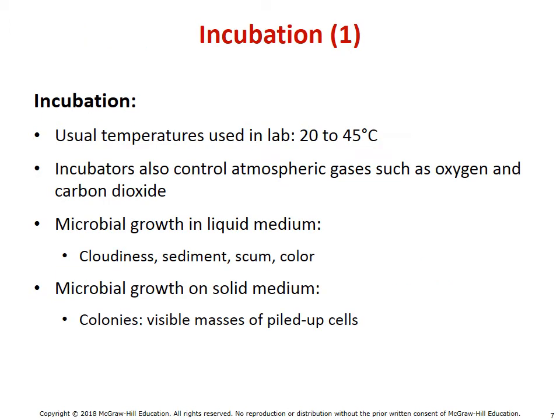The next I that we should talk about is incubation. Incubation is designed to allow us to provide the resources, beyond just food resources, that the microbes need. There is an optimum temperature for most microbes to grow, and most incubators run between 20 and 45 degrees Celsius. Incubators can also provide gases required for growth, including things like oxygen. Our incubator in the laboratory is set at 37 degrees Celsius, which is body temperature. But it also uses atmospheric gases, so it's the same air that you and I use to survive.